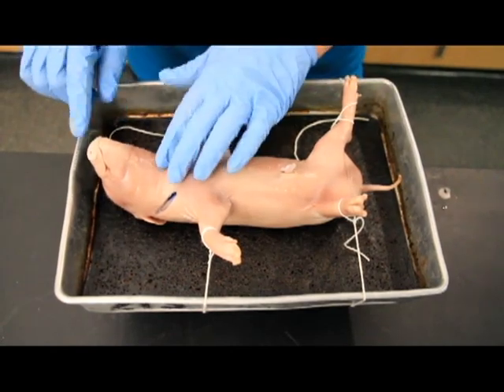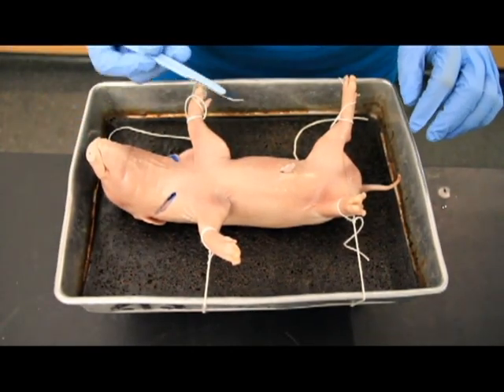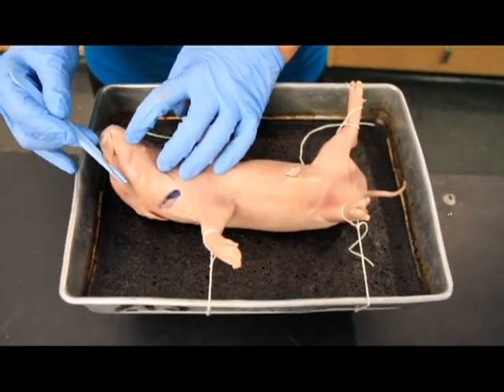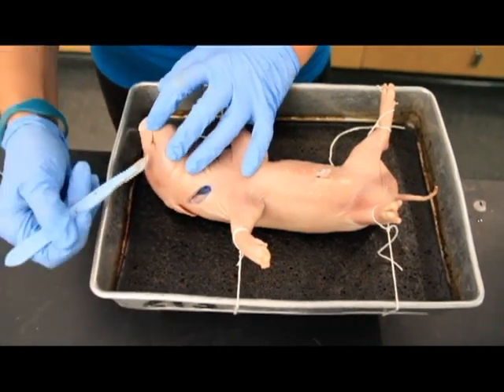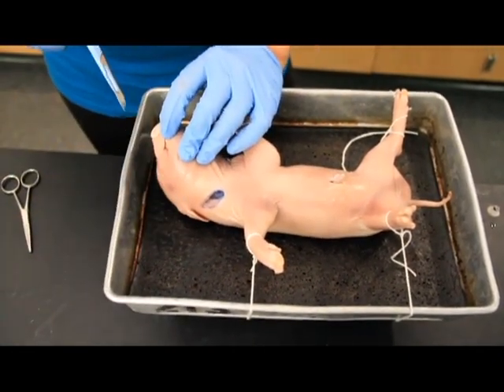So now we can start working on the mouth. So this is the one place where you actually want to use your scalpel, and that's because we're actually going to be breaking these jaw bones here. So what you want to kind of do is you want to almost Joker him and keep his smile going all the way back. What we don't want to do is lob off his whole head.